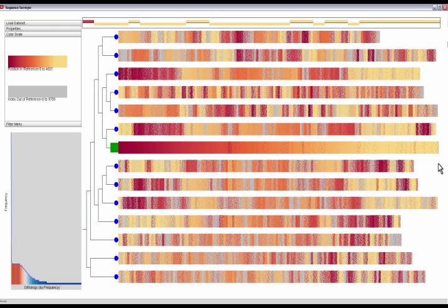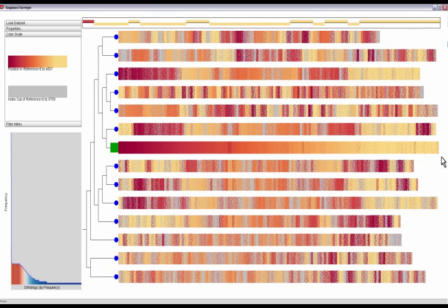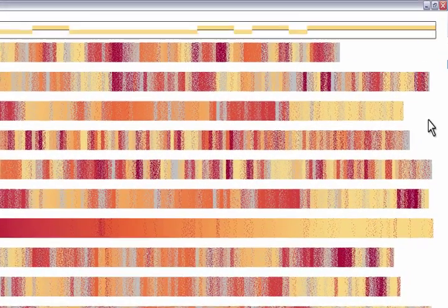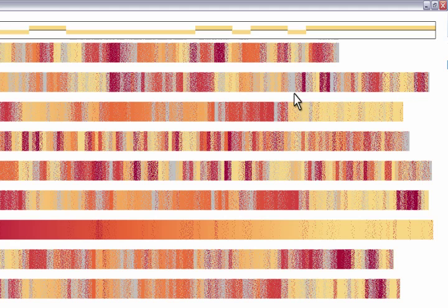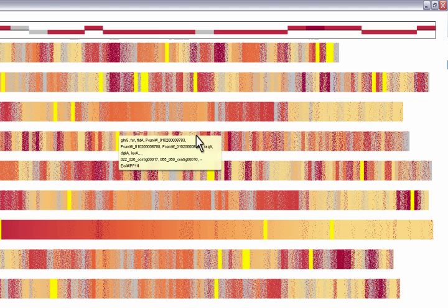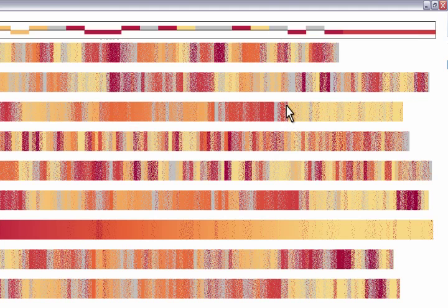Genes not in the reference are colored gray. Color weaving is used to convey gene distributions. This view shows shared regions and the preservation and inversion of ordering by the preservations and inversions of regions of the reference color ramp.